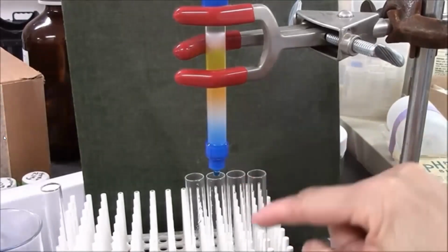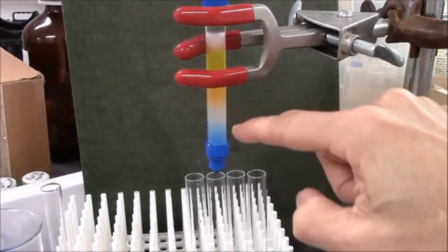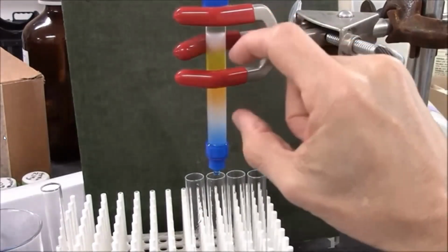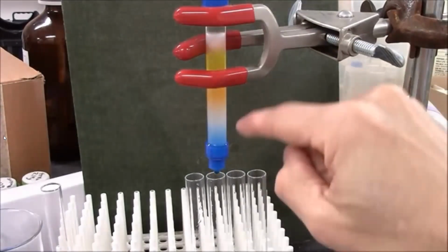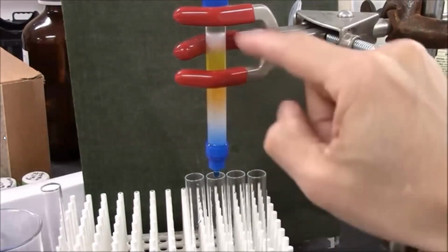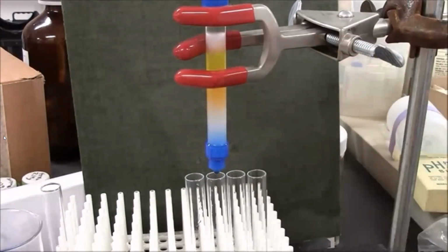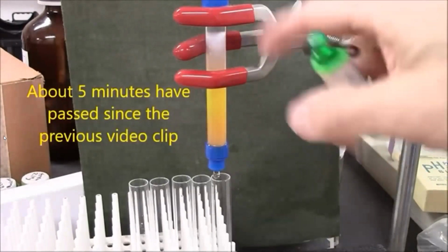So out of the bottom now, blue liquid is dripping. You can see I do have a colorless layer starting to develop here. Yeah. The fluorescein has been slowed down by the gel filtration. The blue dextran is coming through. So this technique is often used to separate a protein, which is large, from the small molecules that could be salts or could be a fluorescent tag that is unwanted. I've topped up with buffer on the top so that it never runs dry.